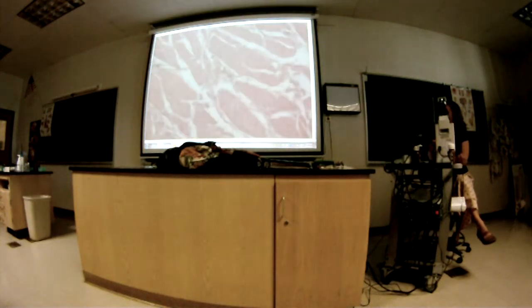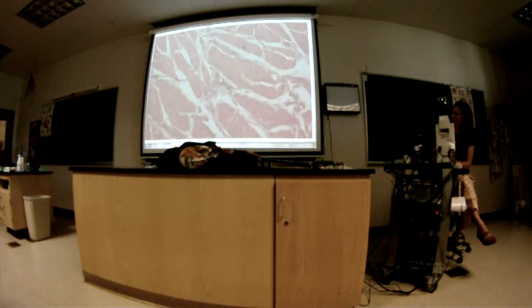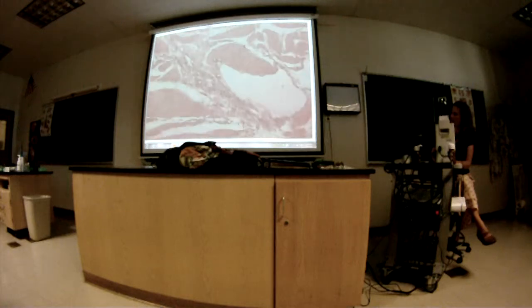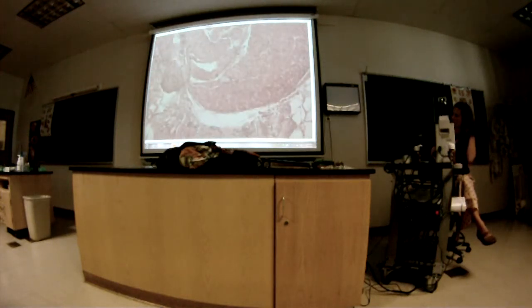It looks a little weird. It's several layers. What kind of section is it? What does it say? Cross section. Oh, now it makes sense. I was cooking right before I came here, so it looked like that. It's just a little piecey, but it still looks like smooth muscle. And it's real thick. It's got 3 layers that go different directions, so you see fibers going all different directions.